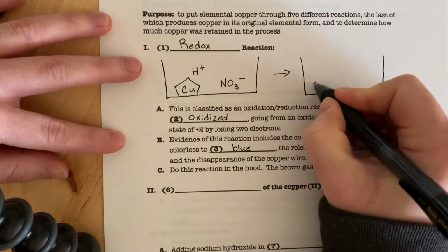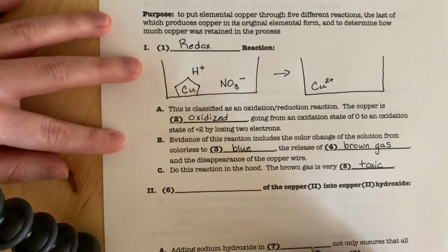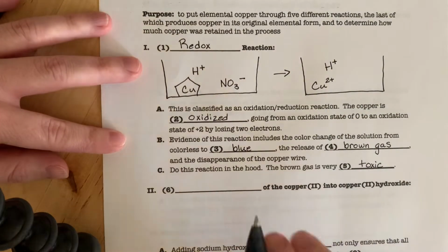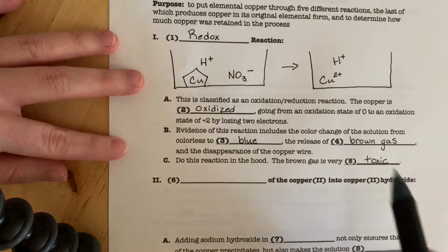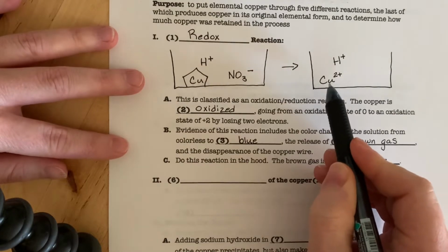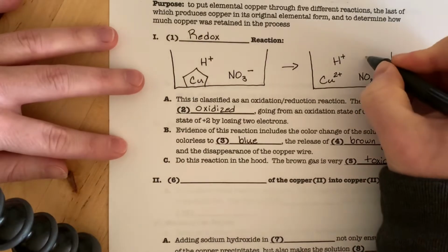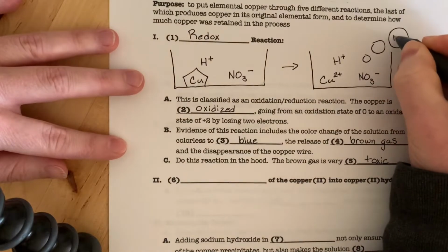Like we said, the copper gets oxidized, so it's now aqueous in solution. We still have a bunch of H+. We added way more H+ than we actually needed to, because we wanted to make sure that every last atom of copper was oxidized. We still have some NO3-, some nitrate, and then there's the brown gas that came off of that, or NO2.